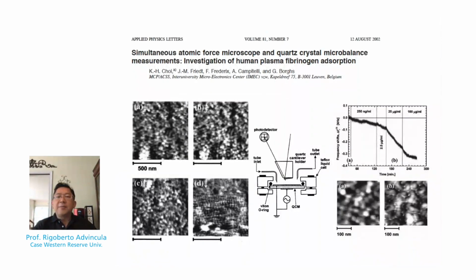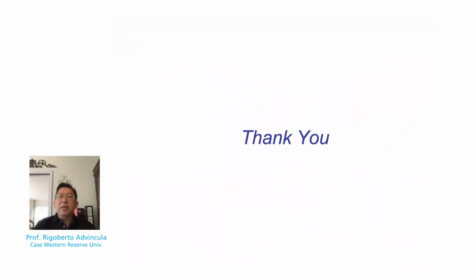So I think we ran out of time. As I've said, my objective here was to introduce QCM, to reintroduce AFM, and then to combine the two methods into what hopefully will be useful hyphenated techniques, in-situ techniques for combining both experiments, for future reference, and also for designing new experiments in investigating phenomena. So with that, I'd like to thank you, and I'll be happy to answer any questions you may have.